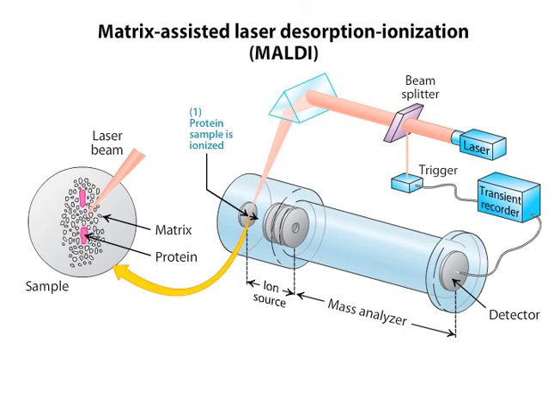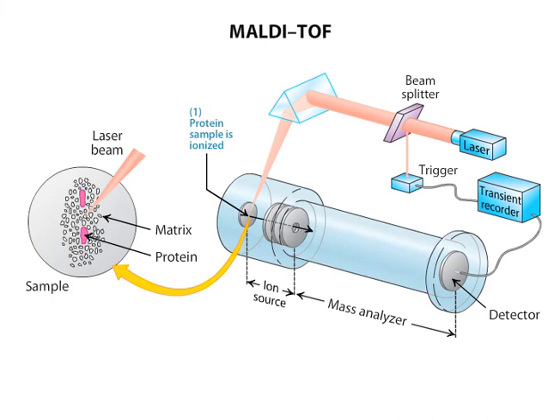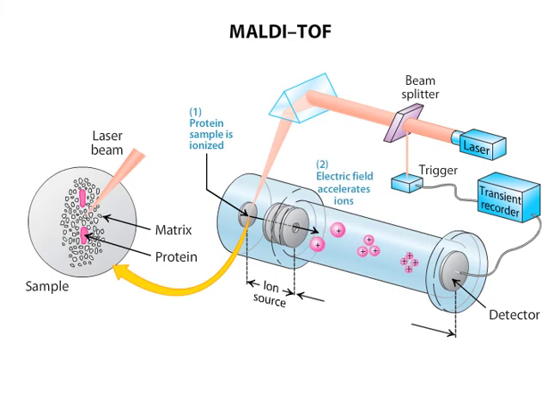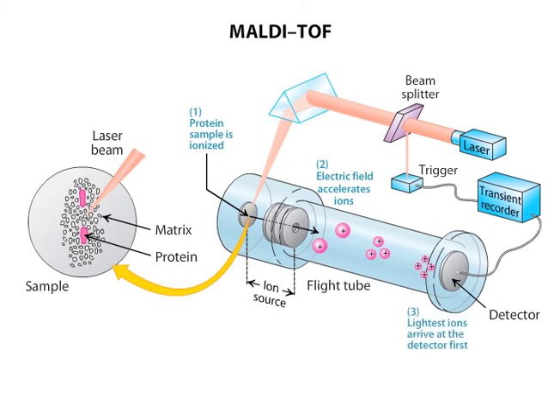The newly formed protein ions then enter the mass analyzer, where they are distinguished on the basis of their mass-to-charge ratios. One commonly used mass analyzer is the time-of-flight, or TOF, analyzer. The TOF analyzer uses an electrostatic potential to accelerate the ions through an elongated chamber called the flight tube. The smaller ions travel faster and arrive at the detector first. Time-of-flight mass analyzers measure the ions' mass-to-charge ratio by utilizing this relationship between the ion's mass and its flight time. The clock that measures the ion flight time is triggered by the laser beam that ionizes the sample.